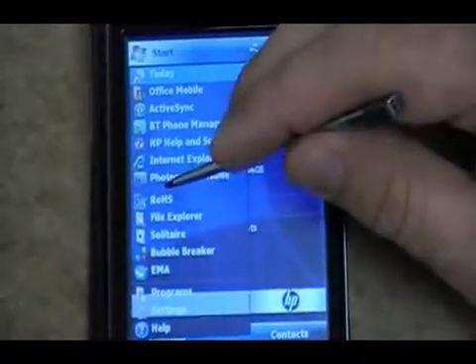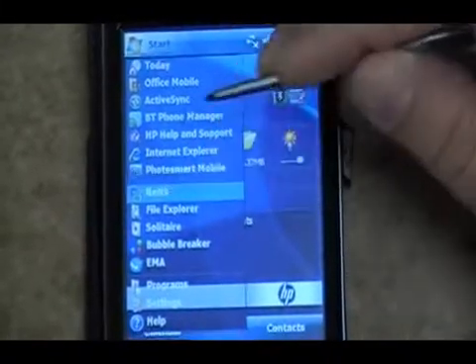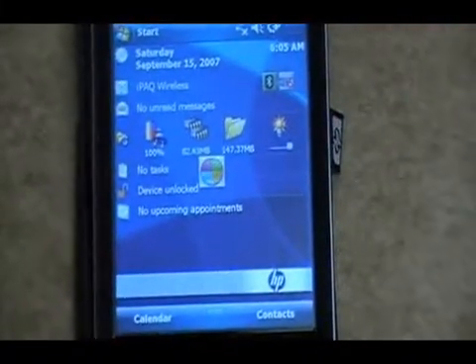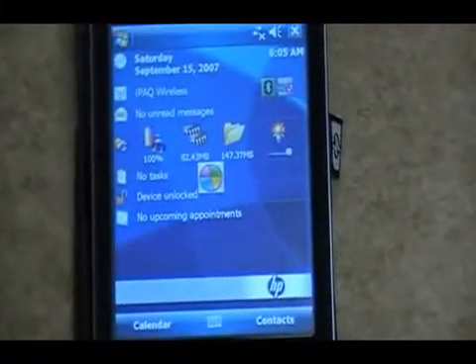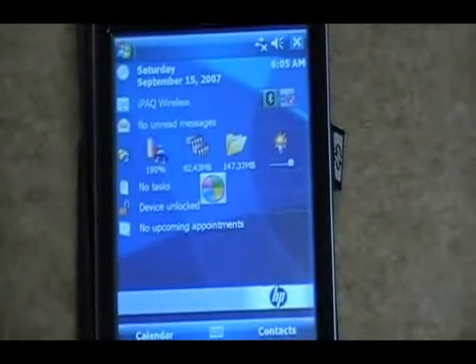Go to the ROHS program. It then loads onto the PDA.